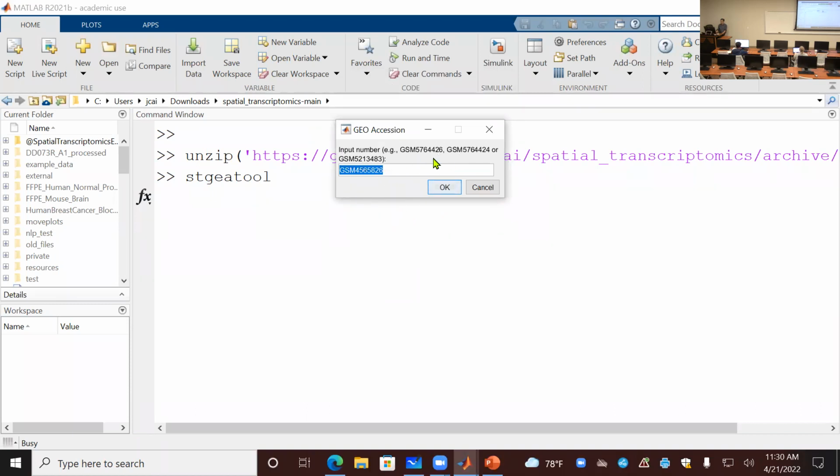And you can use those example numbers if you like, but here I'm going to show a random sample I pick. I've never seen it, but hopefully I can get it wrong. So here I type in the sample ID with the Visium technology, which should already have the spatial transcriptome data and image.